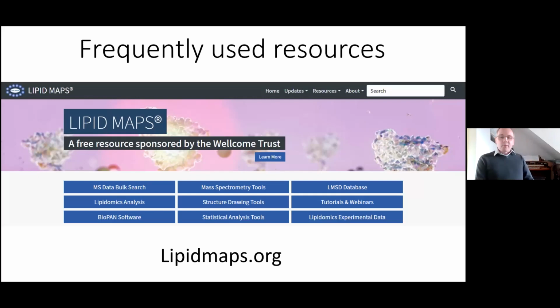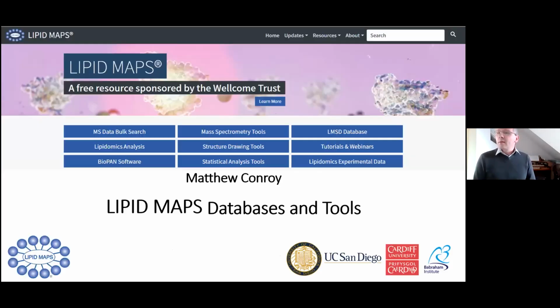So to finish off, I'm going to talk about the Lipid Maps databases and tools. Many of these have actually already been covered throughout the week, which is great because it saves me talking about them, and they've been covered by people who are far more expert in them than I am.